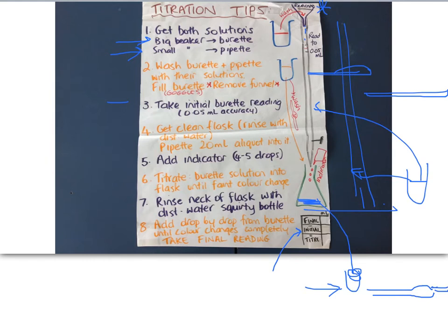Then you want to get your flask and make sure that's a clean flask. It can be rinsed with distilled water. It doesn't matter if there are some drops of water in this conical flask, because all your calculations are going to be from the 20 mils that you accurately add from that pipette. That's going to be accurately rinsed with that solution and whatever concentration it is. So that's why you can rinse down this flask during the titration with water, because all our calculations are done with that 20 mils.